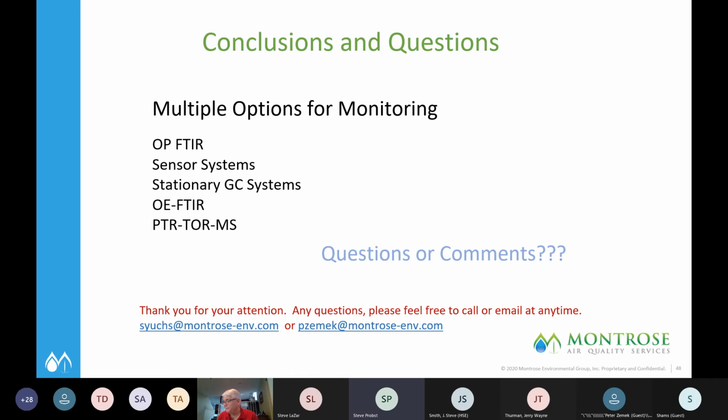Does Montrose have any experience with ethylene oxide leaking into heat exchange systems, cooling towers, and any test methods that can be used to detect EO in a cooling tower? The way that you usually test for that, you have a couple different ways. You could use the El Paso stripping board, which is what's used for HRVOC testing.